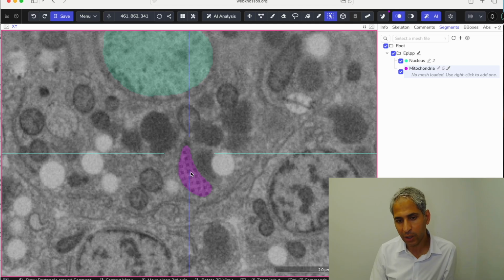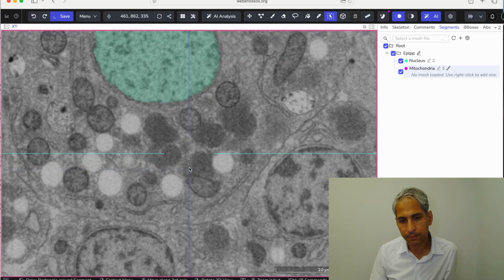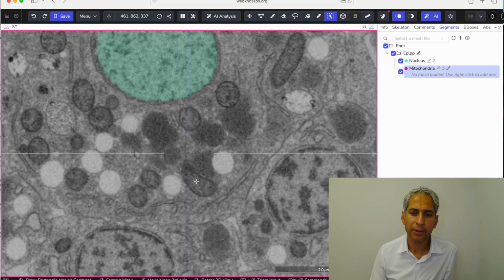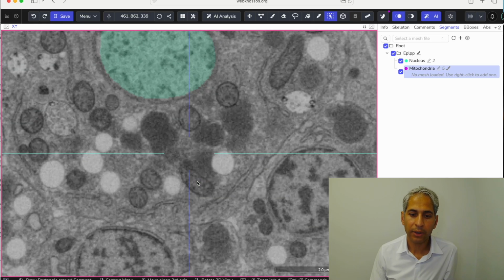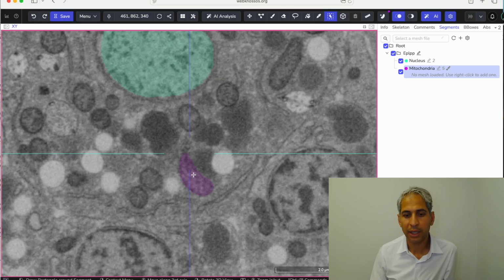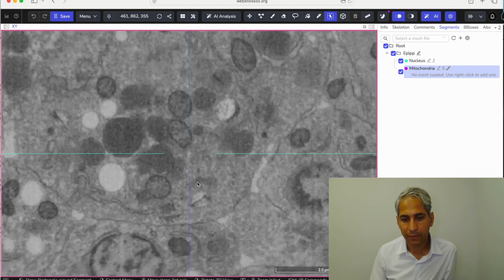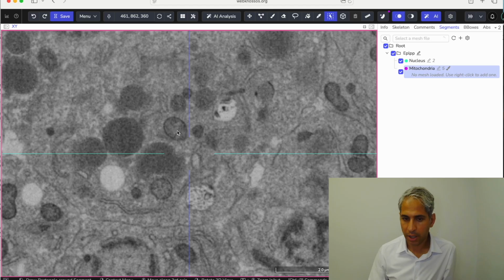So I'm going to click this as well. I'm not going to rush and click interpolate until I get the rest of the mitochondria, and then go back and see what gaps I have. So let's go a little bit deeper. Oops, this is a part 2. I'm going to highlight, and then oh, I saw one that wasn't. I'm going to highlight this one too. Oops. I have to make sure I don't move my mouse before I click. Let me go back.